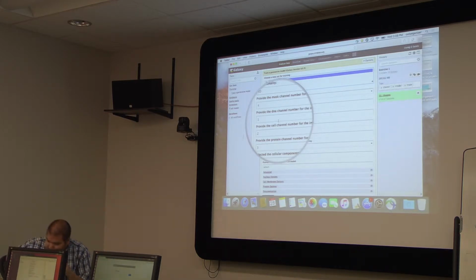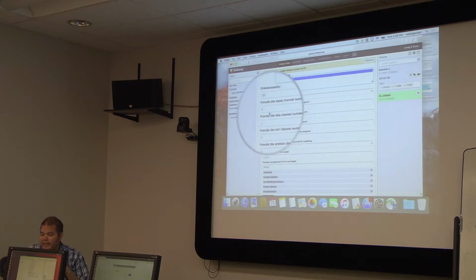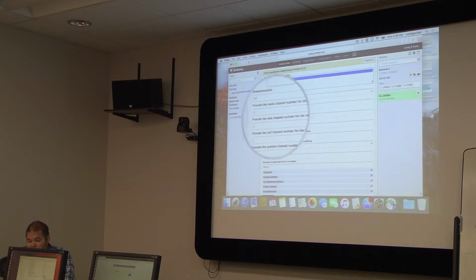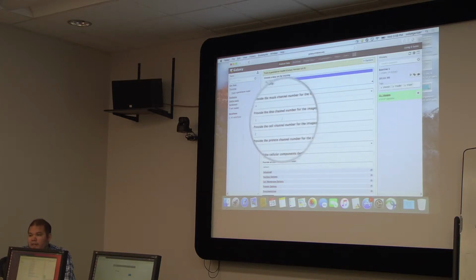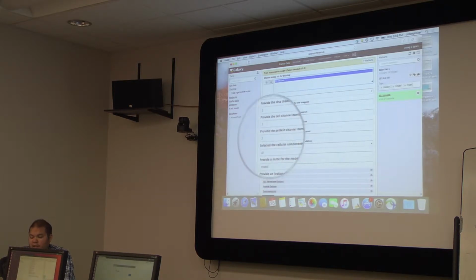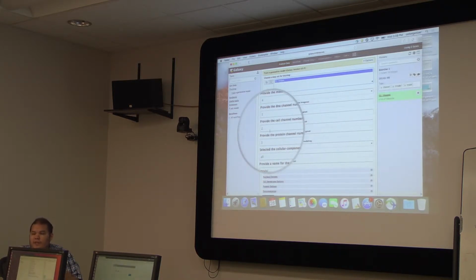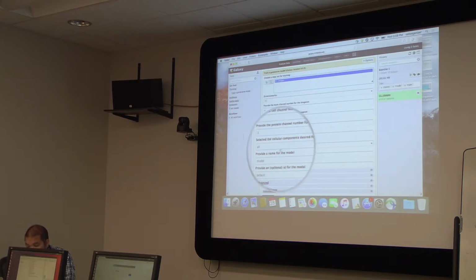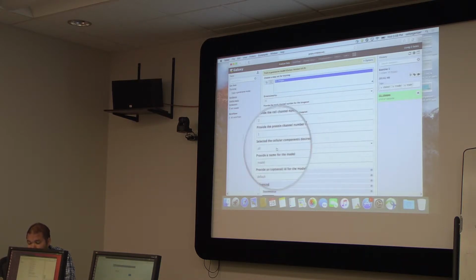In this case, I'm saying at index 4, you can find a mask for the images. At index 1, you will get the DNA channel. At index 2, you will get the cell channel. And then CellOrganizer can process those images and extract the right stack and put them in the right position in the model. And then here at the end, select the cellular components desired for modeling.